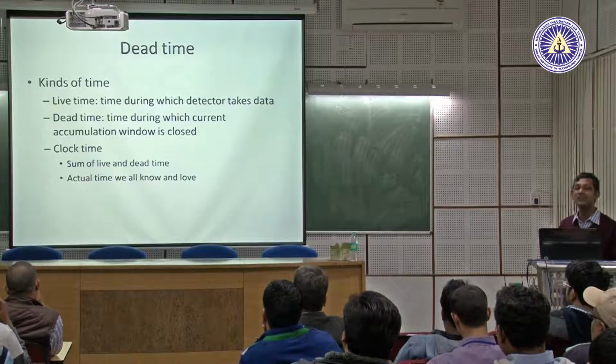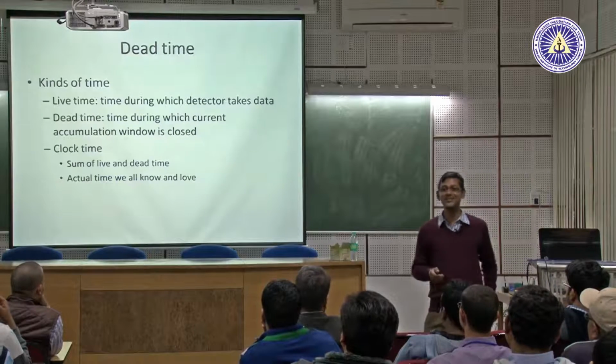Okay, now something else. In EDS detectors, there is something known as dead time.